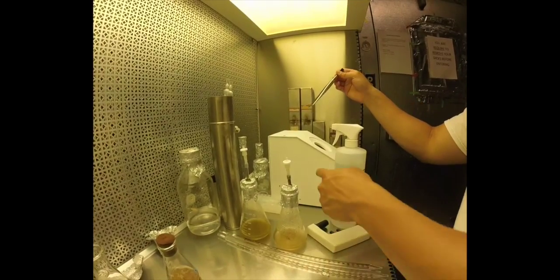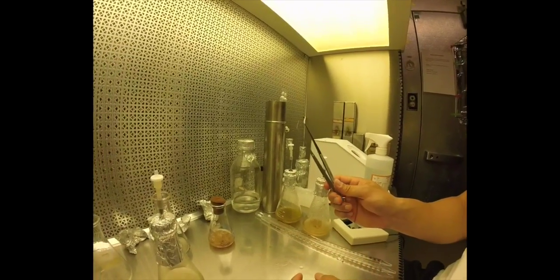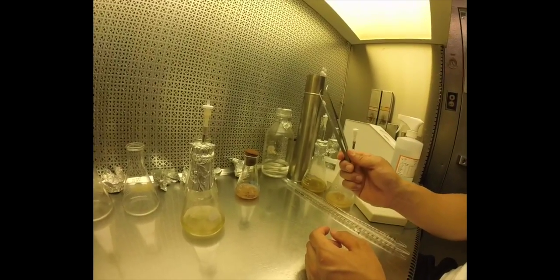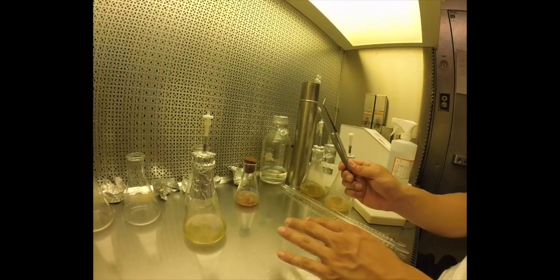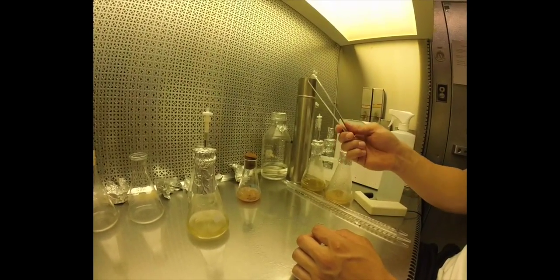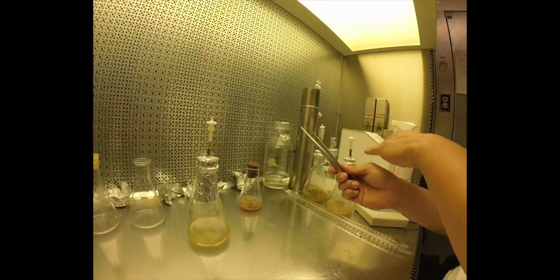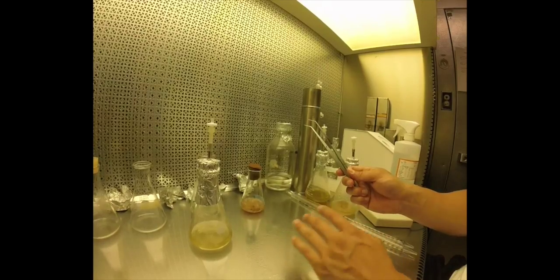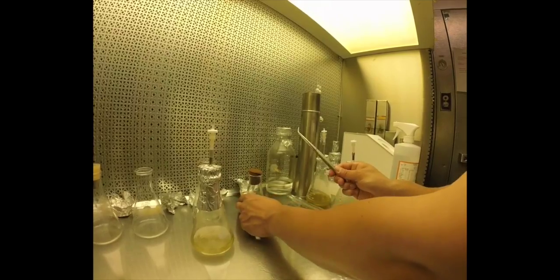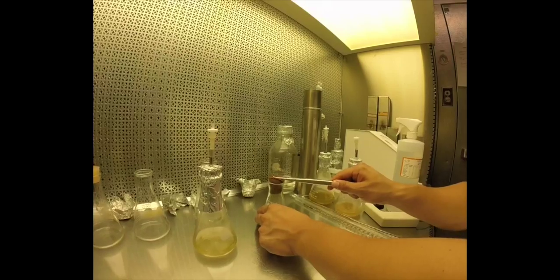These beads, there are beads in this little container here, and they reach above 250 degrees Celsius. So that's a quick way to sterilize your tools. You should only leave it in there around 10 seconds. And if you touch the media with your forceps, you don't want to put it into the beads directly. You don't want all that residue in there. So that's why you want to spray it down with ethanol beforehand. Okay, so let these cool down a little bit so you don't burn the stopper.